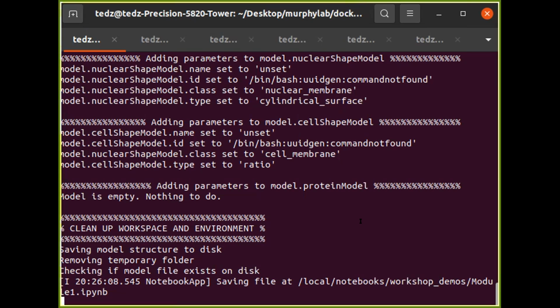All it does is tell you what folder you want to connect to this container, that's this local folder, and then it runs that particular container. That's what you would do in terminal, and then terminal would show you all the output.